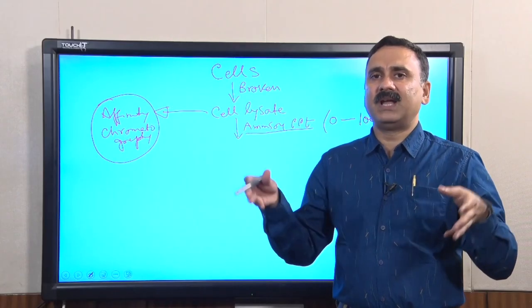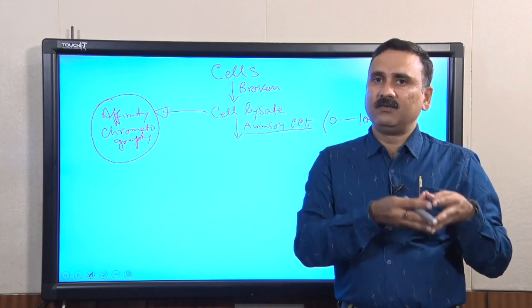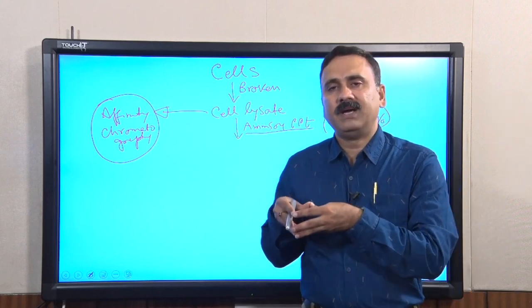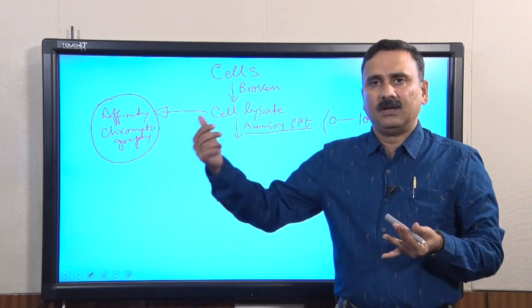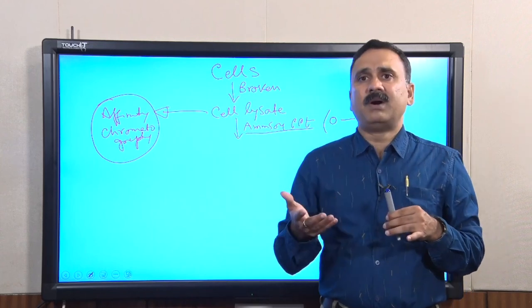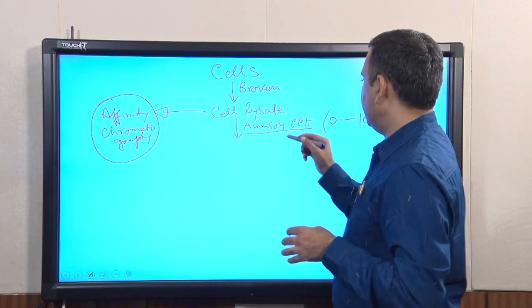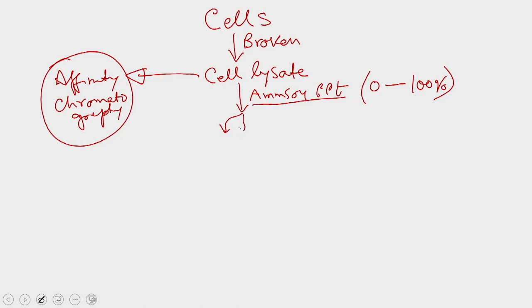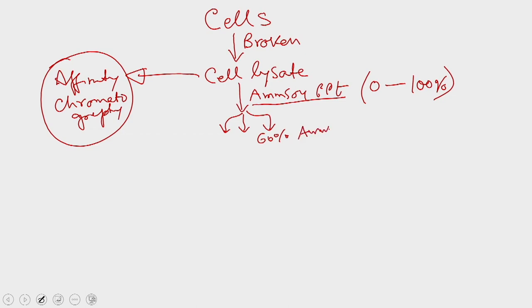All these different fractions can be collected and tested for the presence of your protein. Either it will be by Western blotting, or by enzymatic assays, or sometimes simply by looking at the SDS-PAGE and the molecular weight of your protein, because we are talking about cells which are overexpressing your protein. Now you have the different fractions of the ammonium sulfate. Suppose 60% is the fraction where your protein is present. Now I have the 60% ammonium sulfate fraction.